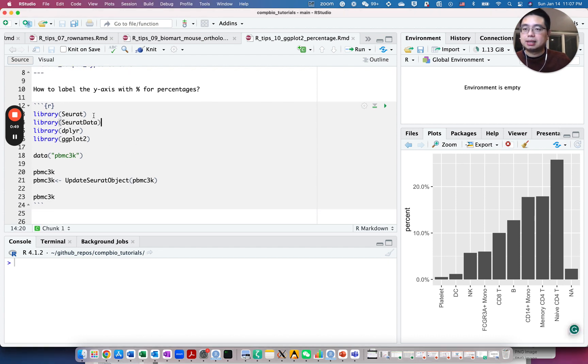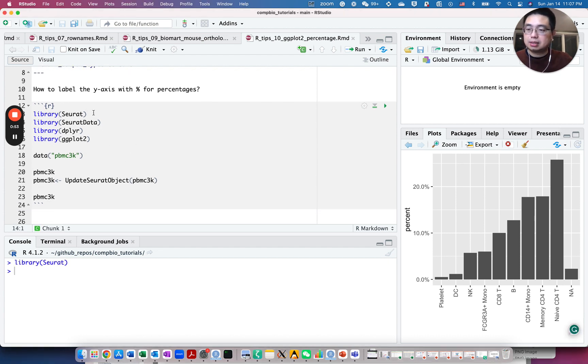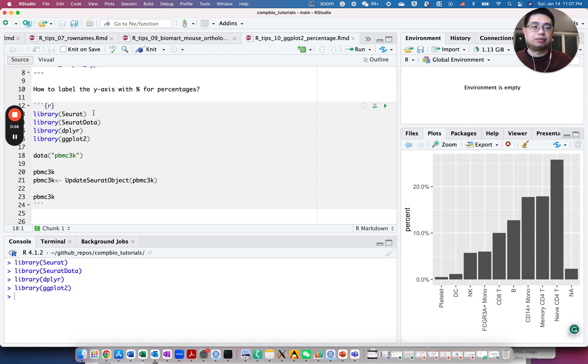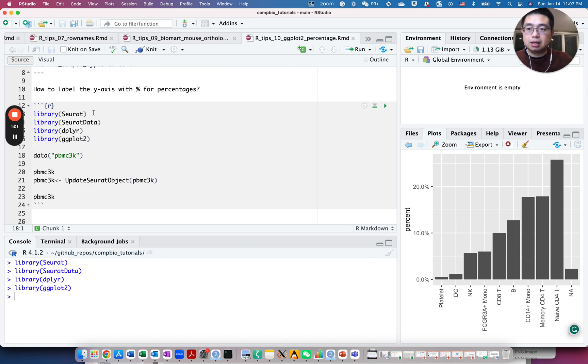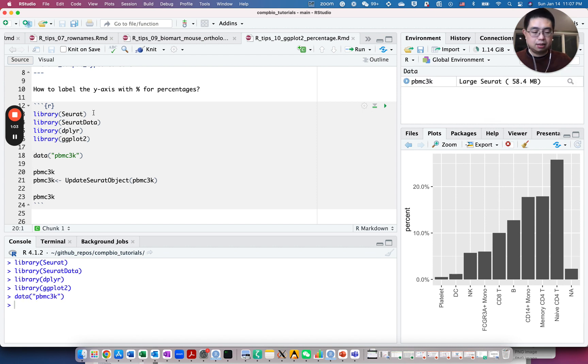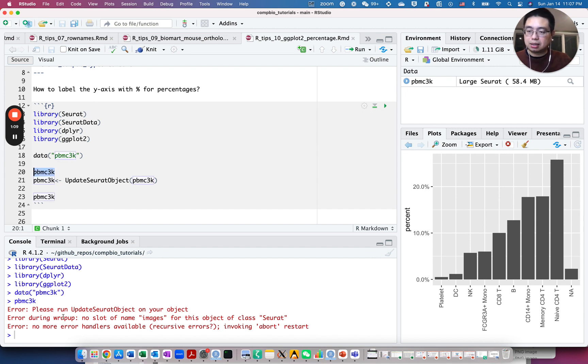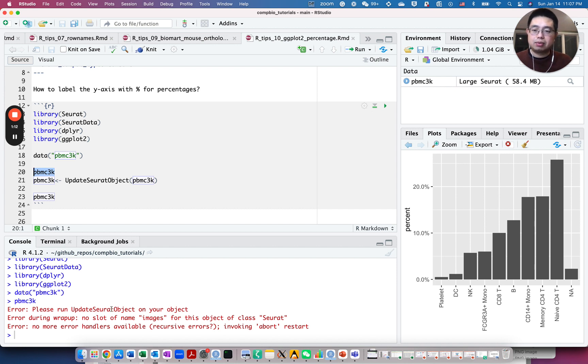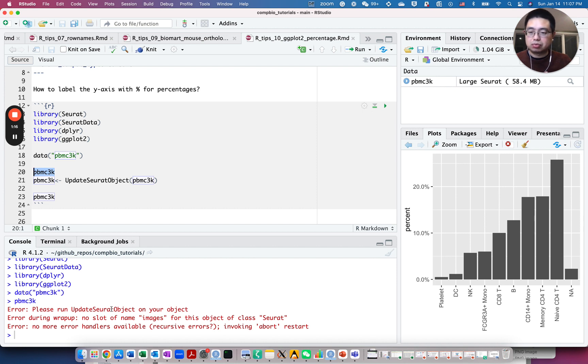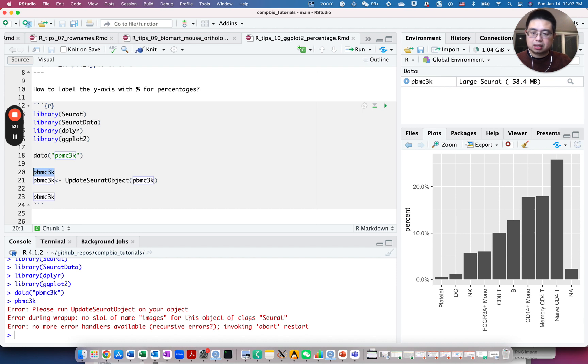Let's load some of the libraries: tidyverse, dplyr for data wrangling, and ggplot2 for plotting. And let's load the data PBMC 3k. After I load this data PBMC 3k, I got this error. So it's actually very common to get errors, but make sure you read the error messages so you understand what's wrong. It says no slot of name images for this object of class Seurat. Please run update Seurat object on your object.